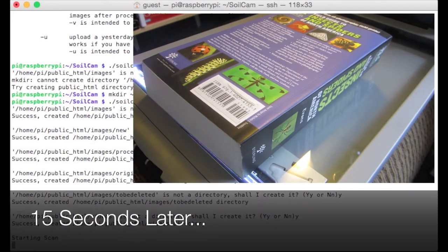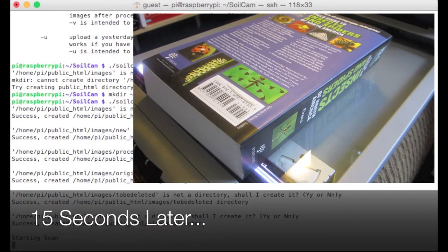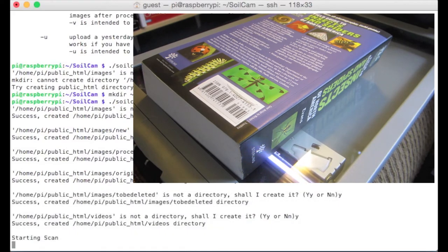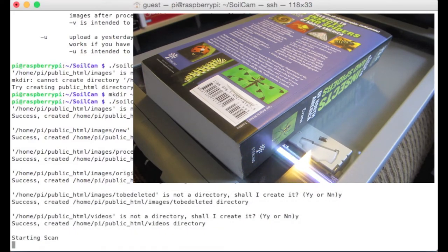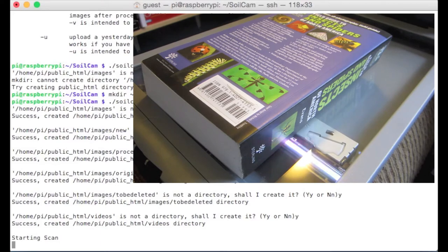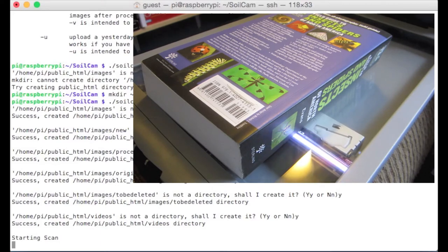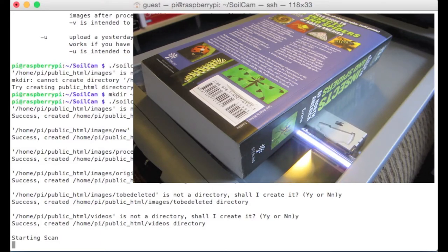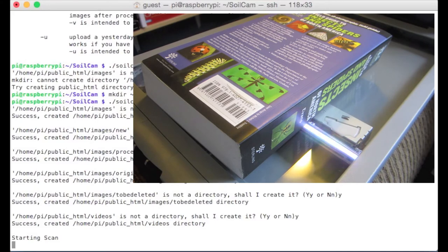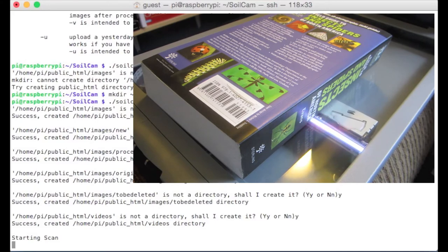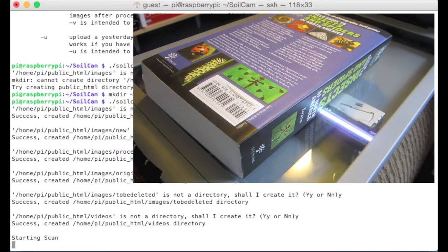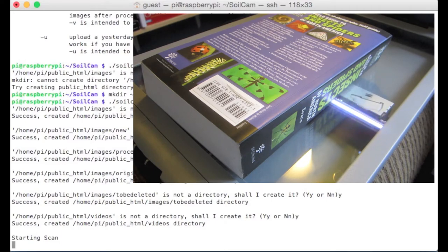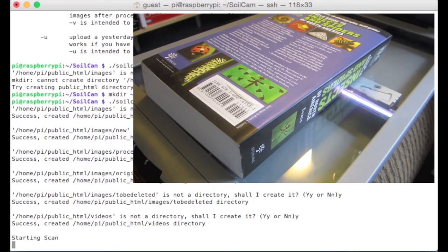So it's starting a scan. I'm currently using a Canon Lide 20. This is a really old scanner. That's kind of nice. One, there's not a whole lot of modern day operating systems that can use this scanner anymore. They haven't bothered to make drivers for it. So unless you have something like the Linux operating system or the Mac OS and software like SaneScan, these scanners are almost unusable to most people. So it's a nice way to use a piece of hardware that's otherwise almost unusable.